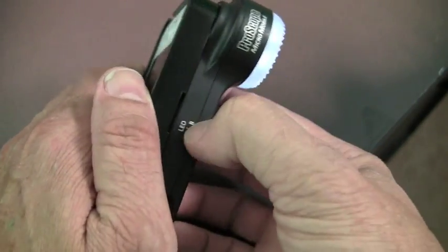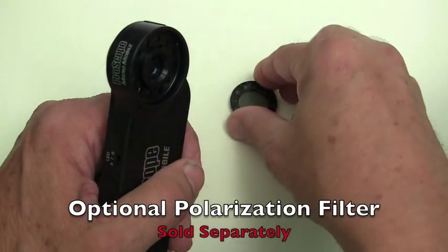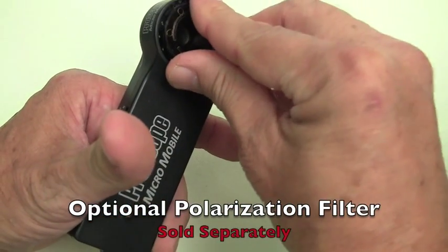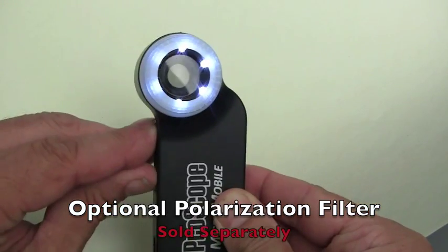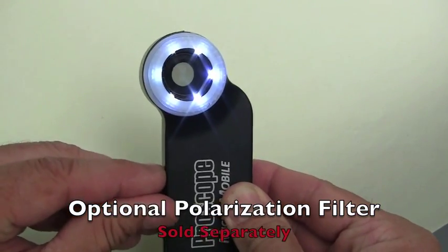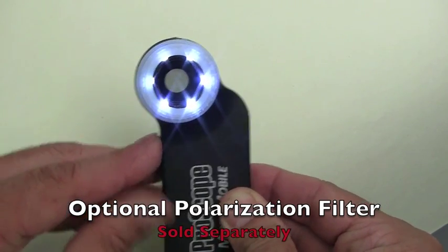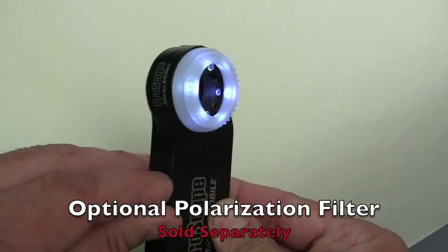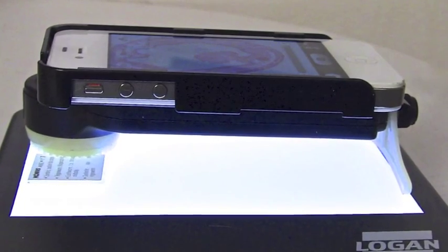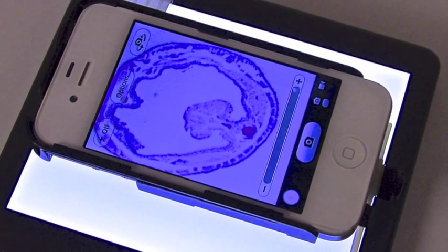The A-B switch is used when you have the optional polarization filter mounted on the lens. The A position activates the LEDs under the polarization filter for a non-reflective view, while the B position activates the LEDs that are unfiltered for a reflective view. You can also have the power off and use a backlit source to view slides and translucent subjects and materials.